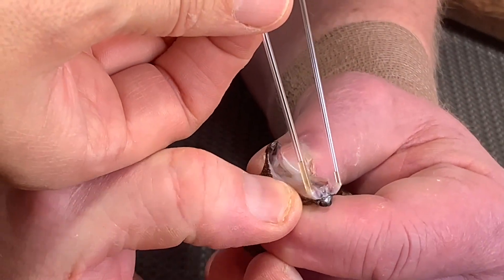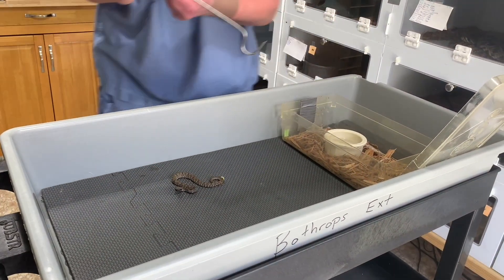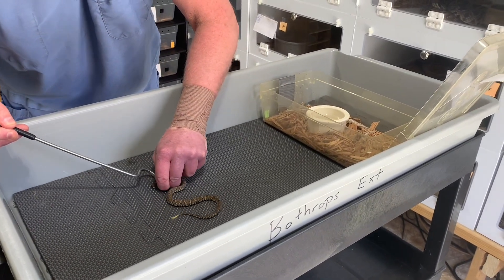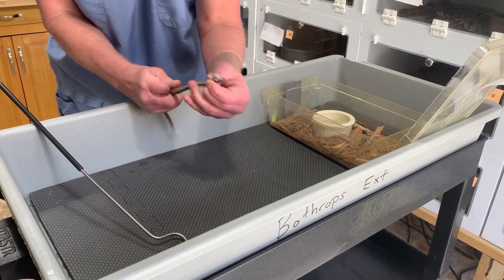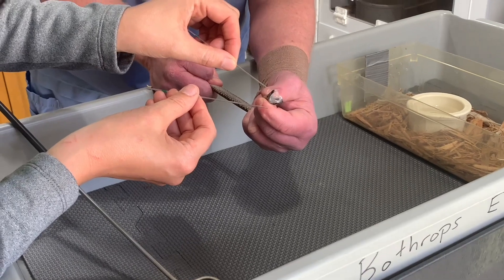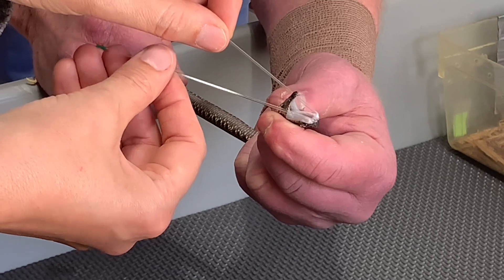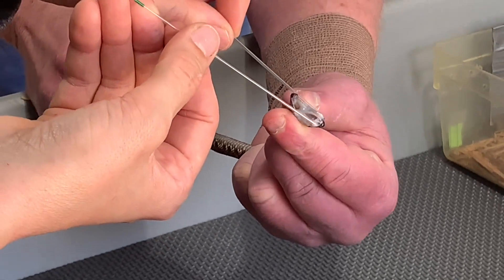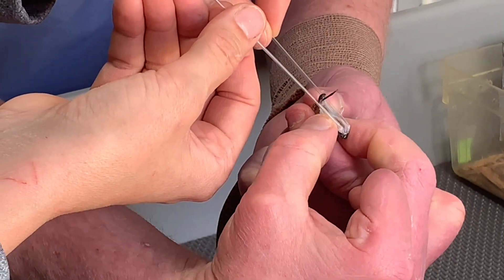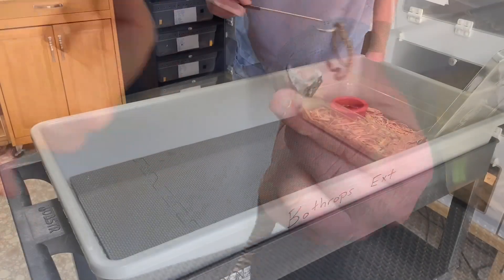Because these little snakes are so small, we're using a technique with capillary tubes. I take one tube for each fang — so two tubes — and we put them over the top of the fang, and then Jim tries to touch the gland a little bit to get some venom to come out. Some snakes gave enough that you could definitely see it in the tube, and some really didn't give any at all. That's fine — those little guys are just going to give what they give.